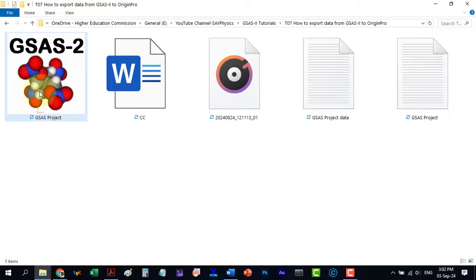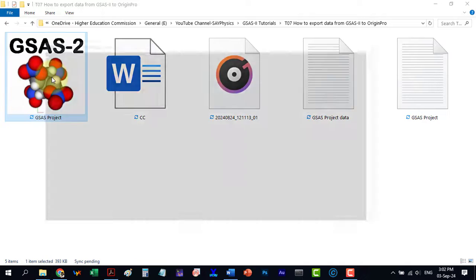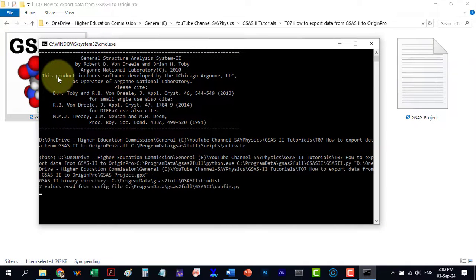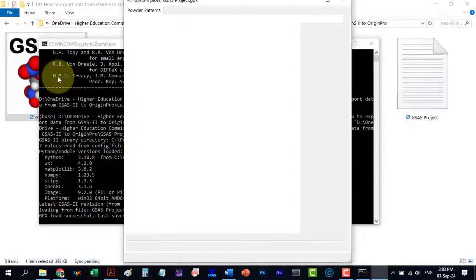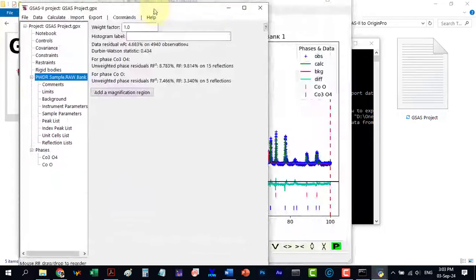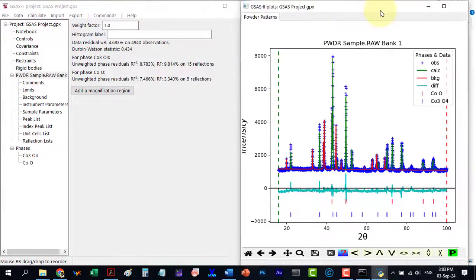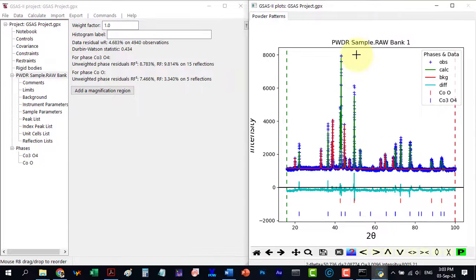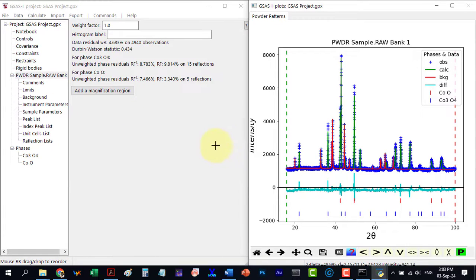This file represents a completed GSAS-2 project. Let's open it now. Here is our finalized project and we want to export data from it.